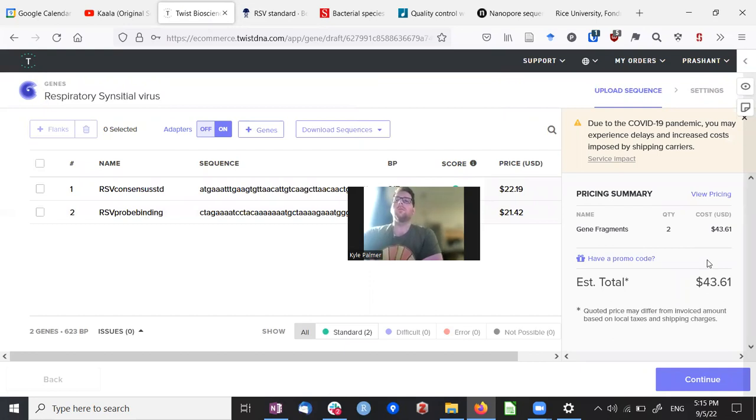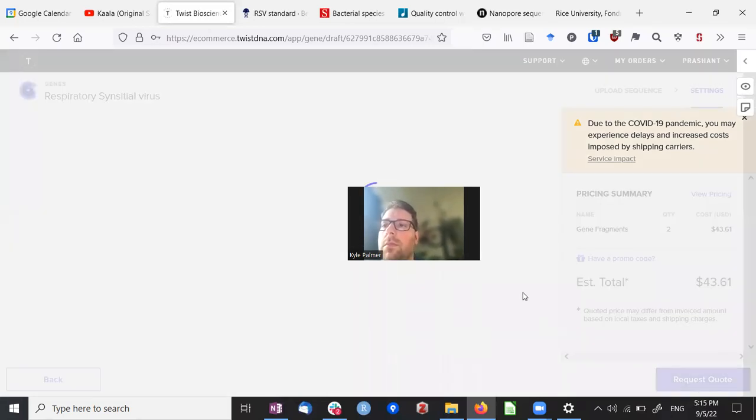But I emailed this company a while ago and they said right before you continue and make the payment, if you email them with the quote number that this generates, they will waive the shipping charges for us. I specifically sent them from Silberg Lab, but maybe they don't care even if it's from Stadler Lab, so it should work. Then you just press continue and place the order and it will go through. Cool.